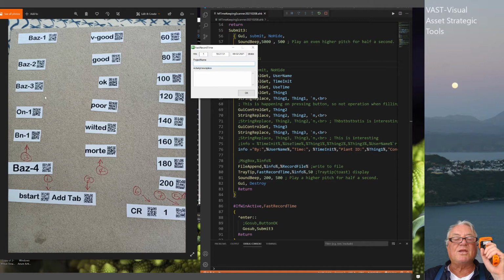Now, I've got the scanner on silent, so it vibrates. When I initially go to scan, it's not doing it. It lasts 30 seconds and then shuts itself off, so that's what I've got as the battery. It'll vibrate and then just die, so I've got to reactivate it first, and then scan something. When you scan something, it vibrates, but that means it's gone to the scanner. It doesn't necessarily mean it's been sent to the PC.